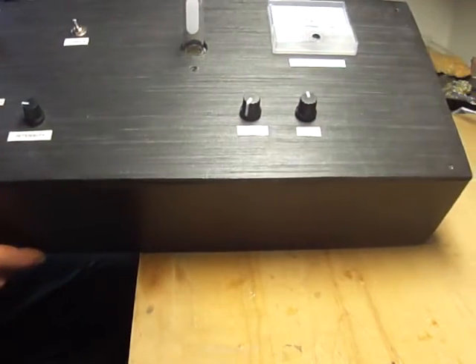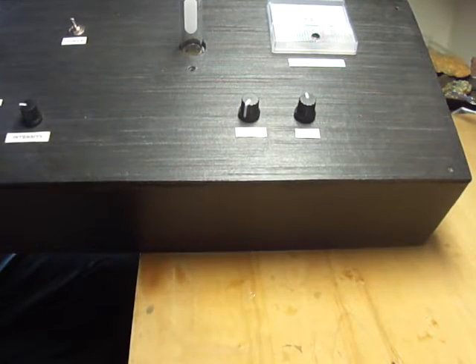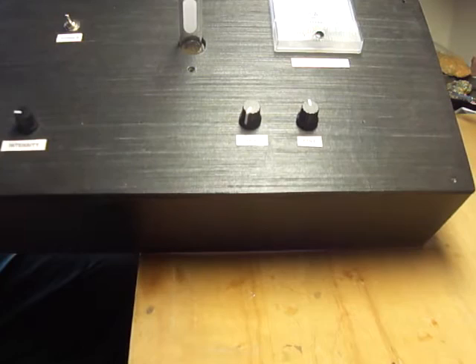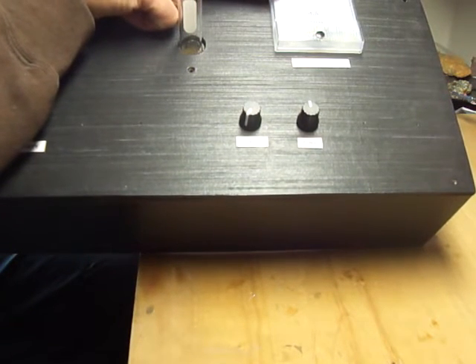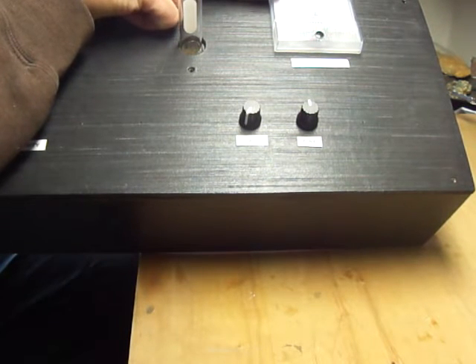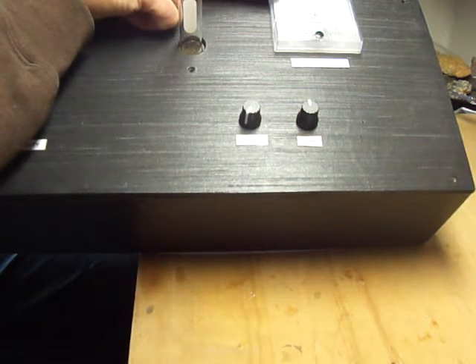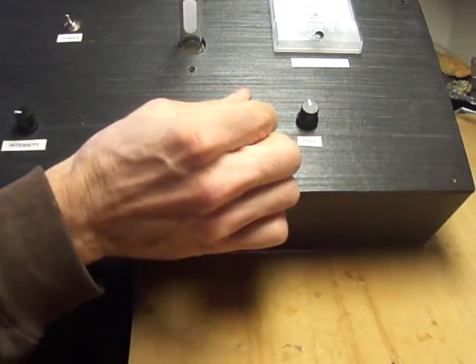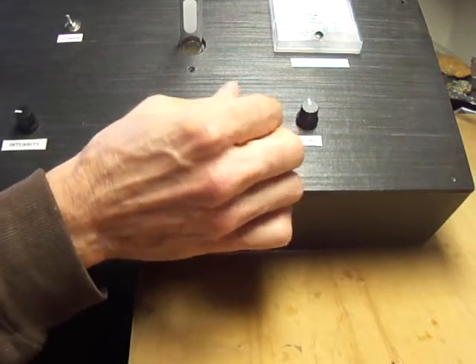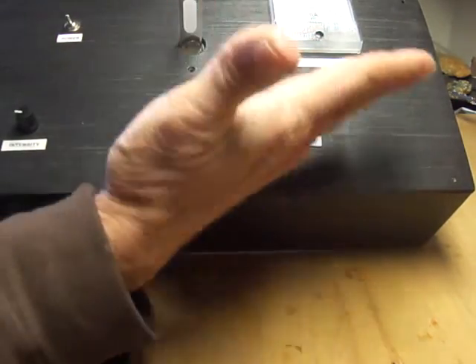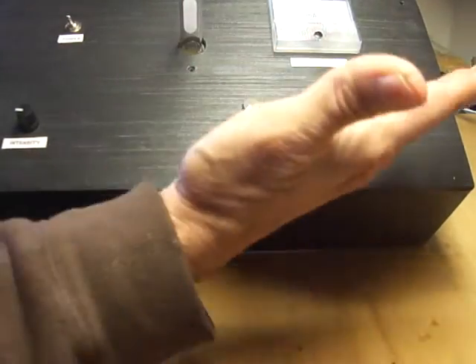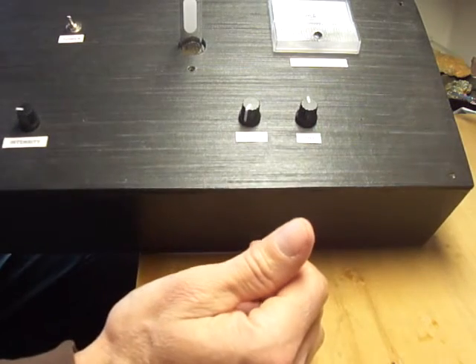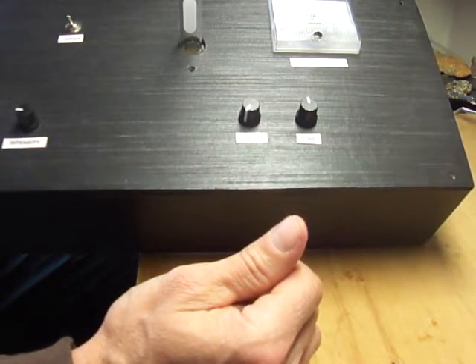On the right side, this has to do with the detector. It doesn't measure absorbance, we're actually measuring transmittance right here, and it's going to be read on a 1 milliamp meter. There's two different adjustments here: a coarse and fine, just potentiometers or variable resistors, so I can put the range wherever I want it based on the sample and the light source and everything like that.